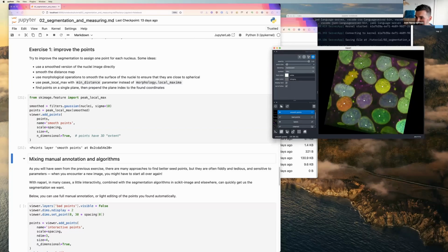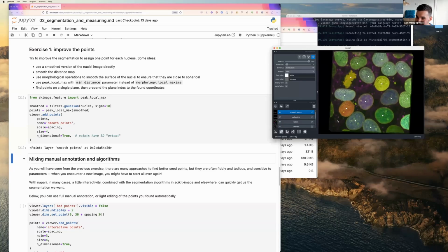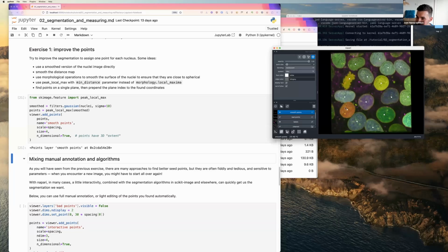And again, this sort of comes from being very familiar with this example. But you can see that even then it's not perfect, right? So we have 1 point here, 1 point here, all of these. We're missing this one. We're missing these 2. And we only have 1, and we're missing that one.